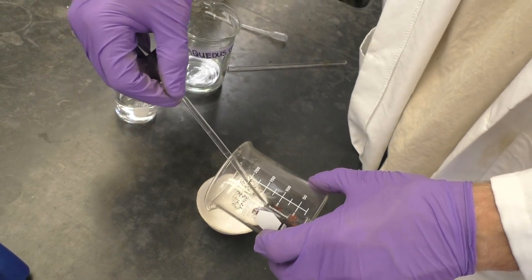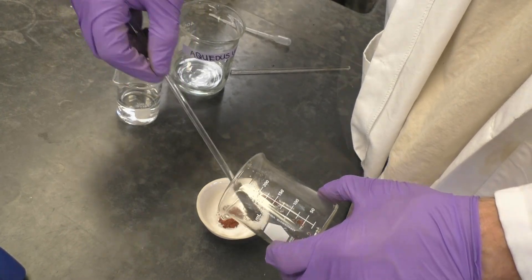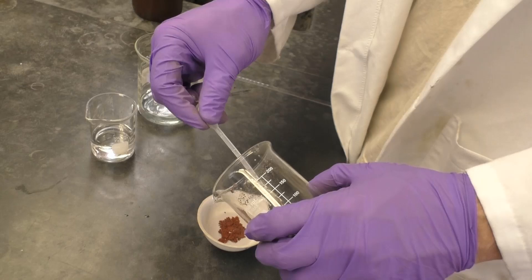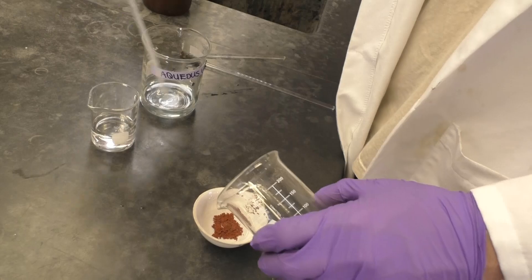Now transfer the copper to your evaporating dish using a rubber policeman. We want all the copper to end up in the dish, so feel free to use water to rinse out your beaker and help transfer all the solid and to rinse off your rubber policeman.